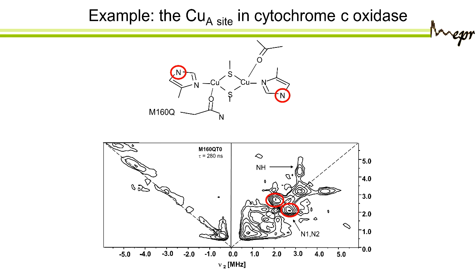double line, but then we see another one, and this is given by the blue. So here, this tells us there is another nitrogen that is coupled, and this is probably a nitrogen from a, maybe one of the backbone nitrogens, and now this gives you information about this particular site. So here you could really identify a new coupled nitrogen that was not expected previously.